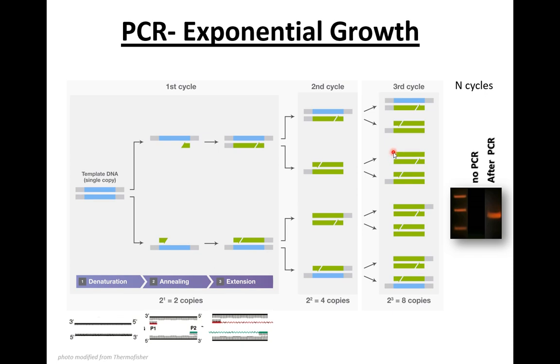The beginning of what is called the left primer and the end of the right primer. We'll talk about that later on. So this piece here, the amplicon, is the one that will later on become the template and become predominant at the end of your 30-35 cycles. And that's what you would see ultimately in a gel.